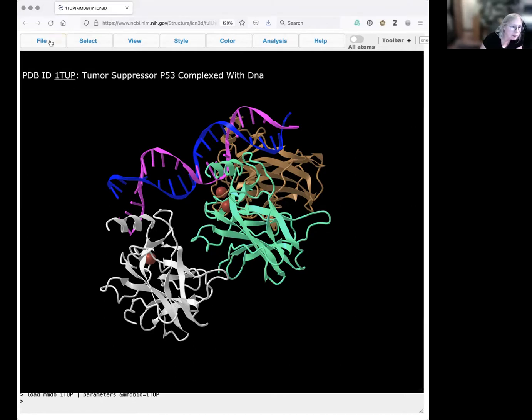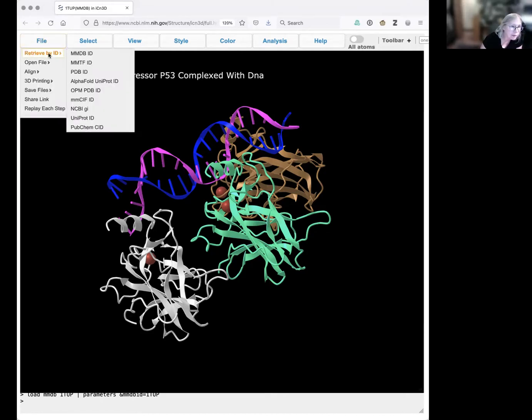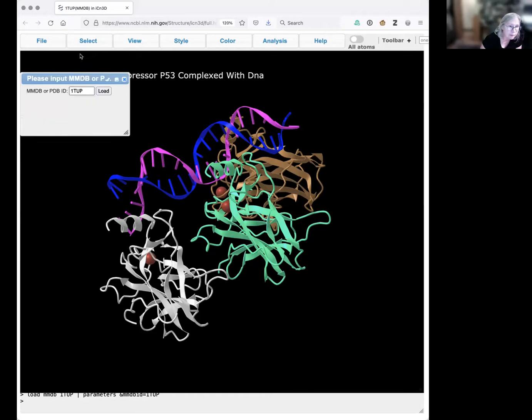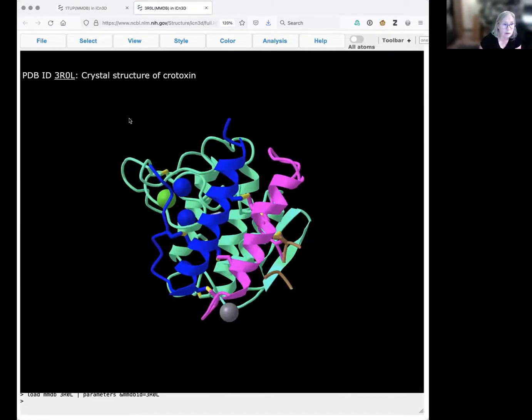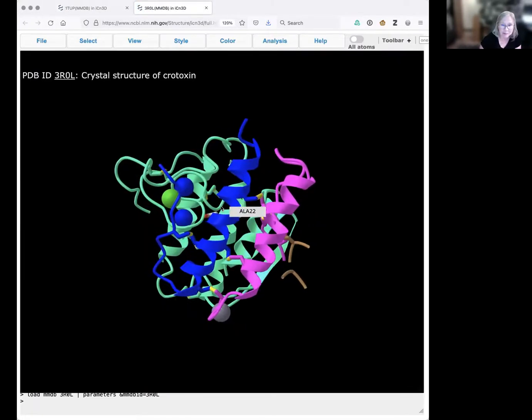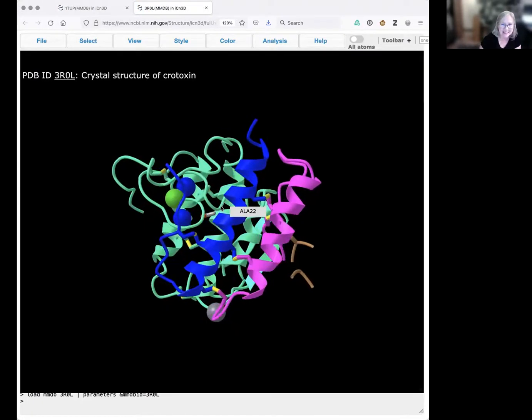First, I'm going to begin by getting a smaller structure. Look for 3R0L, which is a structure for rattlesnake toxin, which is kind of fun.